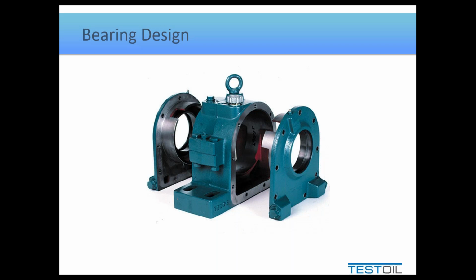And that is the simple improper lubrication and how you could catch it on an oil analysis report. And if we were to go all the way back to the oil analysis report, you would see evidence of that overgreasing had been there since the very first sample. This problem should have been caught 3 years before it happened.